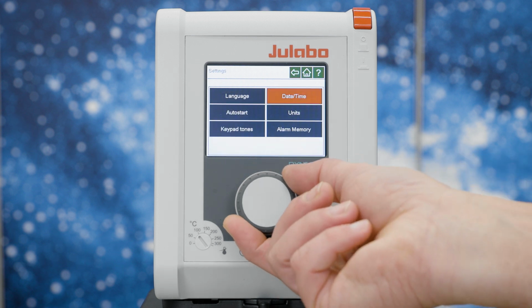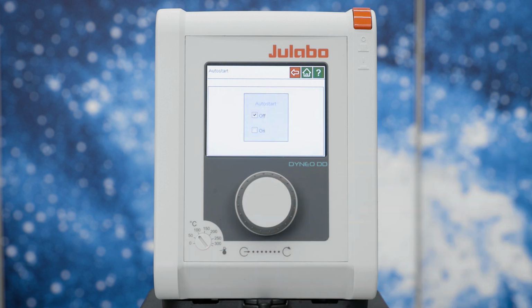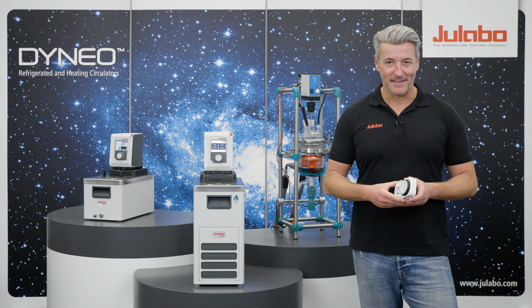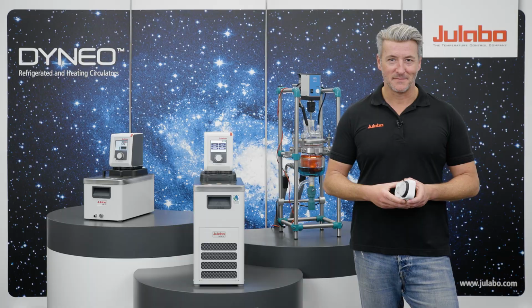Auto Start allows you to directly start with the temperature control process via the mains power switch. The DYNEO will automatically work with the last used settings. Pro tip: you can also use a timer that simply regulates the power supply. To do this, the main switch of the device must remain activated.